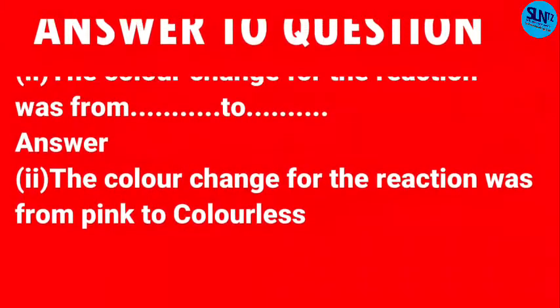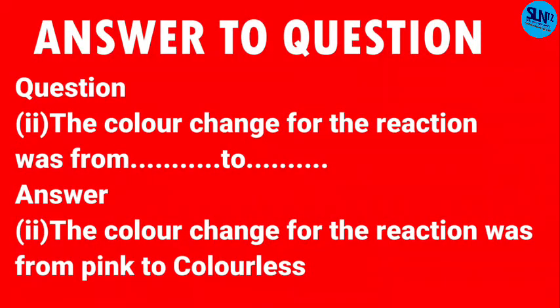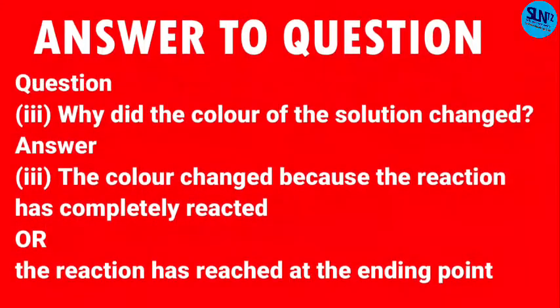The color change for the reaction was from pink to colorless, according to our indicator, which is phenolphthalein indicator. The color change was from pink to colorless. The color changed because the reaction has completely reacted, or the reaction has reached the end point.